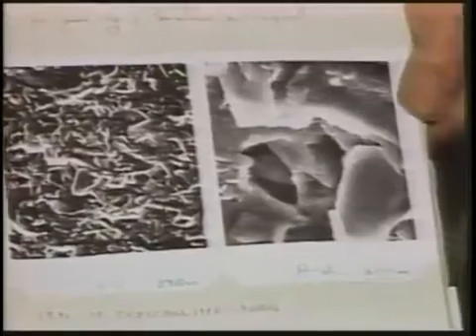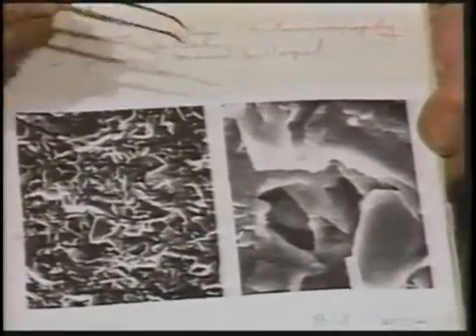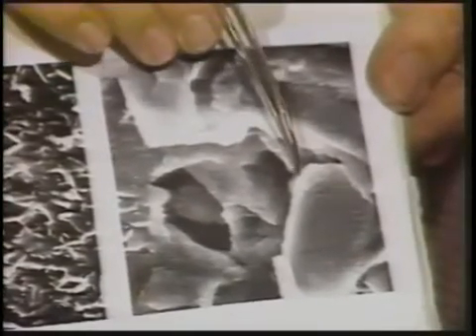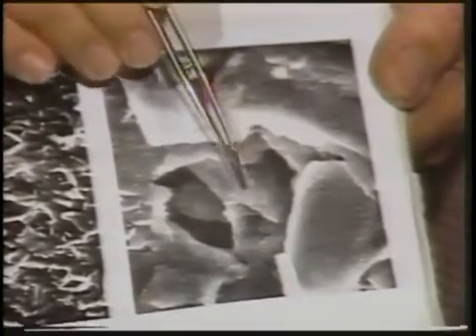The specimen was not touched — I did no gold plating, no metallization of the surface, so it was left alone. What excited me was the tremendous ability to get depth of field in the specimen without ion burning. In other words, the electron beam did not accumulate. These surfaces acted as conductors and gave us a very sharp, clear delineation of the picture. Normally you have to cover this with gold to get a sharp picture.